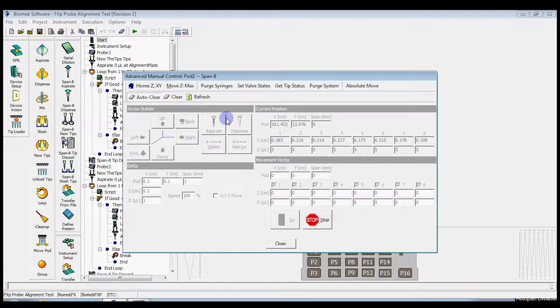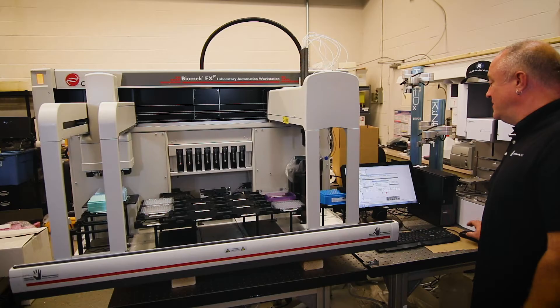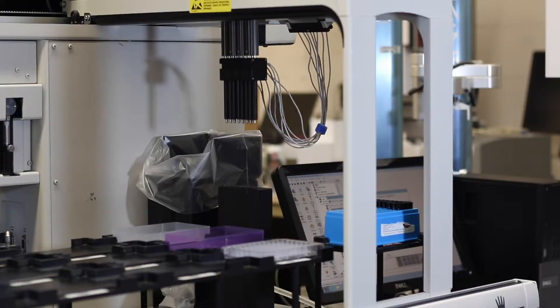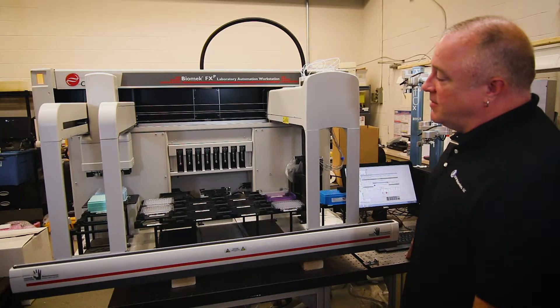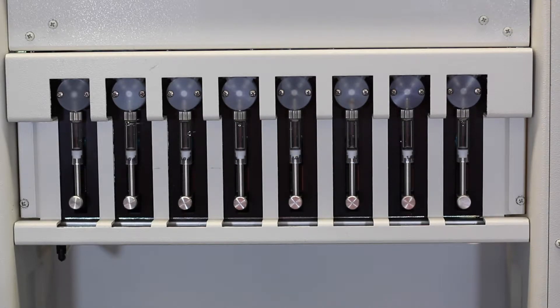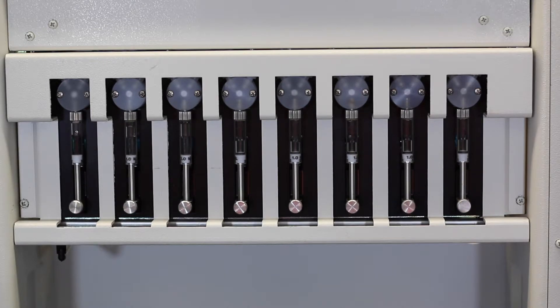Click on it. The pod will go over the wash station for the SPAN 8. Make sure there's nothing blocking the SPAN 8 waste station. When you're ready, go ahead and click OK. The probes will go down to the wash station and the syringes will begin moving. What you want to look for is any bubbles in any of the syringes.